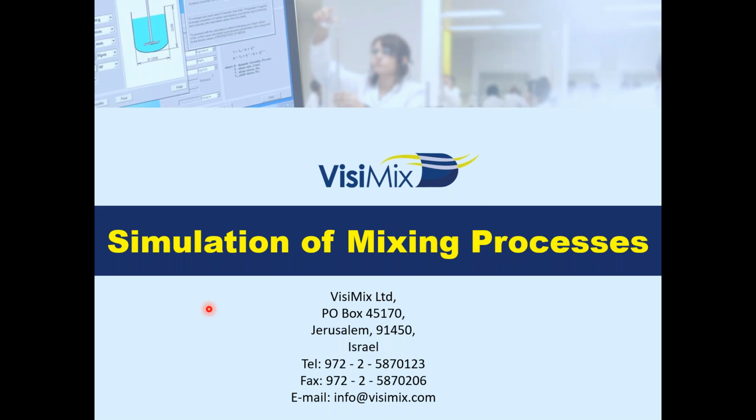We're very excited to provide to you a new VisiMix product and really a new capability that is trying to connect the molecules to the hydrodynamics in models that will be real models and will be representative of the connection and the influence of the mixing in the process.